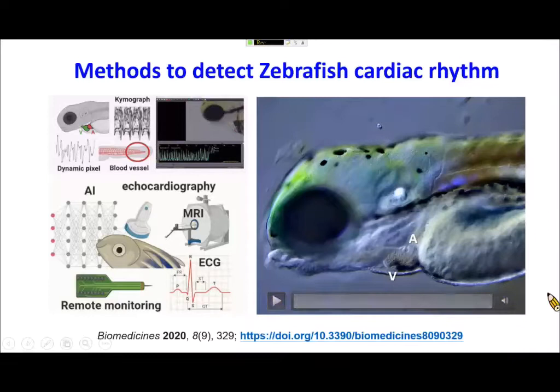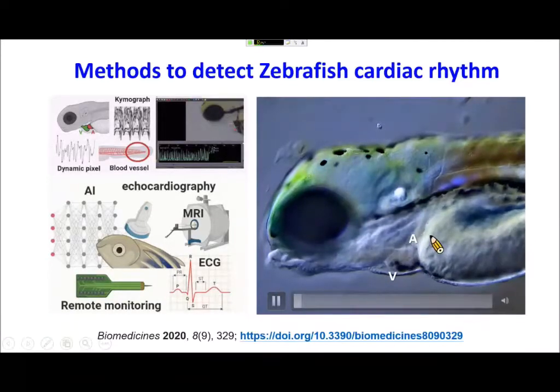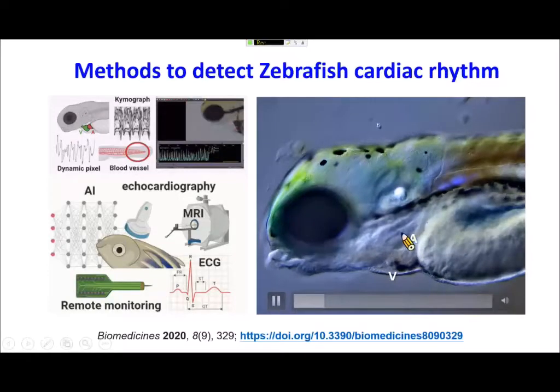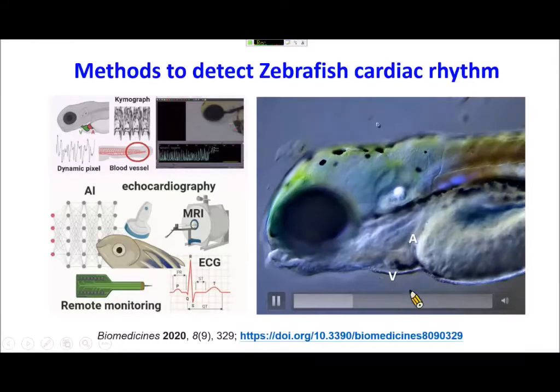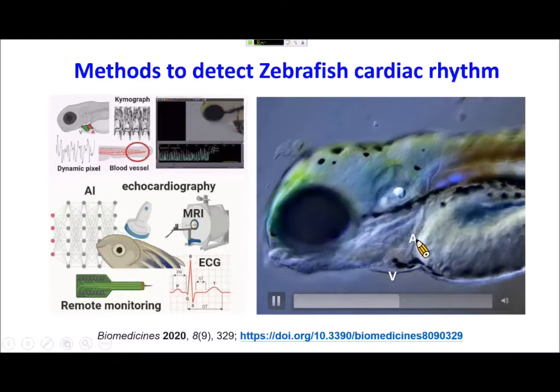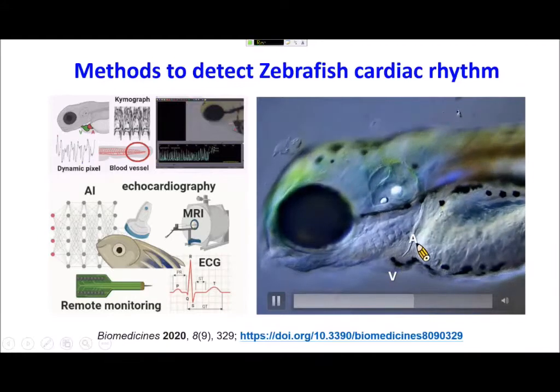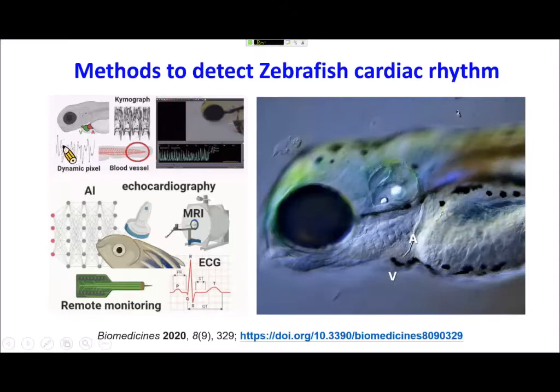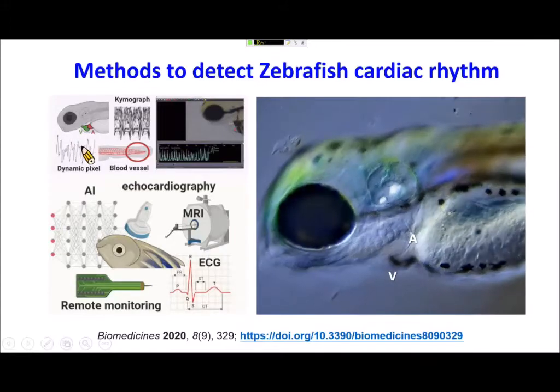This is a video showing zebrafish heartbeat. As you can see, in zebrafish at day 3 to day 5, you can clearly see the atrium pumping coupled with the ventricle pumping. Because zebrafish embryos are transparent during early development, it is very easy to observe the coordinated atrium-ventricle beating. Based on imaging, we can detect the cardiac rhythm.